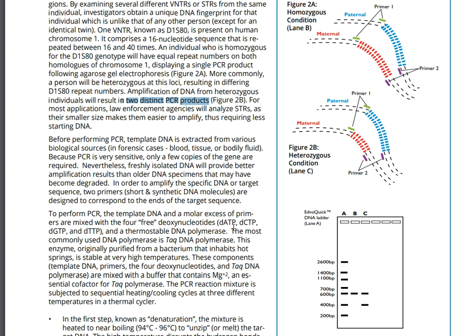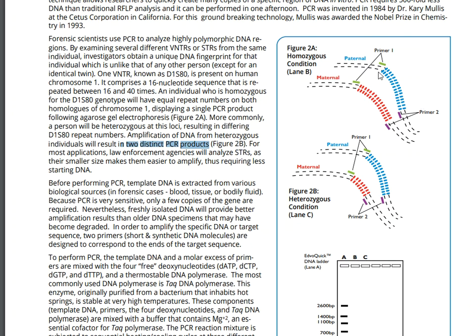So really, this is just one of many polymorphisms that we can focus on in the DNA strand. And this particular one, plus maybe a couple of others, we can use for our advantage. What you're seeing here is a DNA strand on top, and a DNA strand on the bottom. Notice this one is paternal and maternal, meaning coming from the father and from the mother.